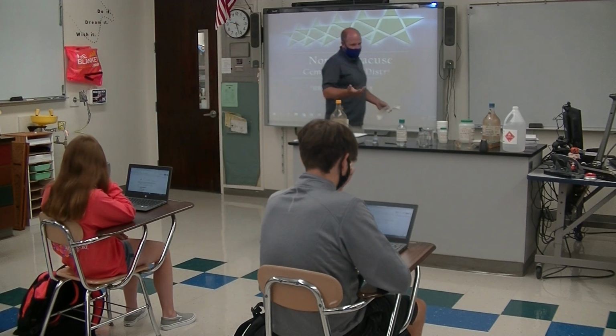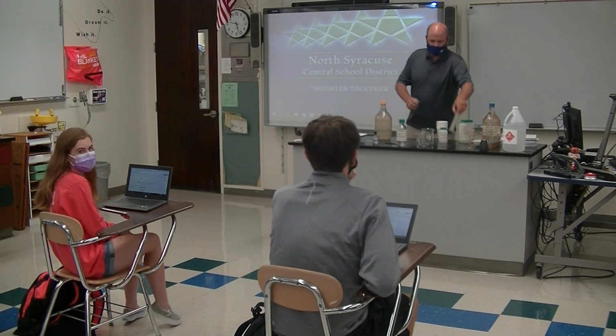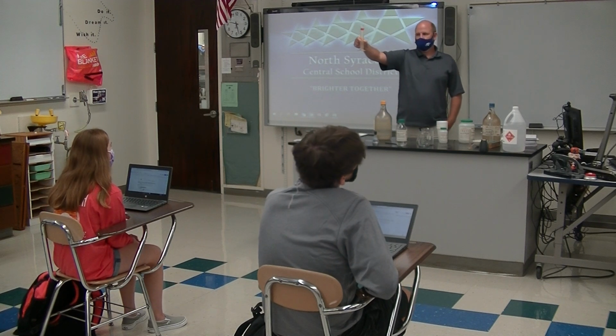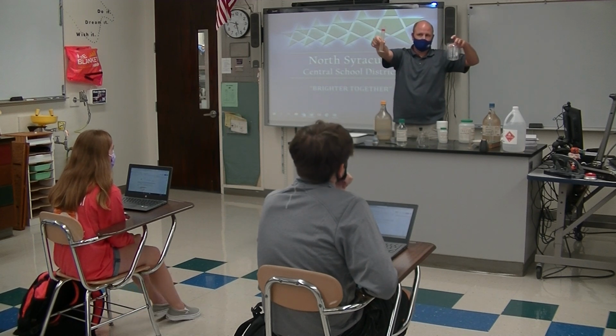So up here, when you guys walk into a room, there's going to be all kinds of things a lot of times. I'm going to talk about some terminology of things. Do you guys know what this is? This is not a beaker. This is a beaker. Do we know what this one is? This is different than a beaker.